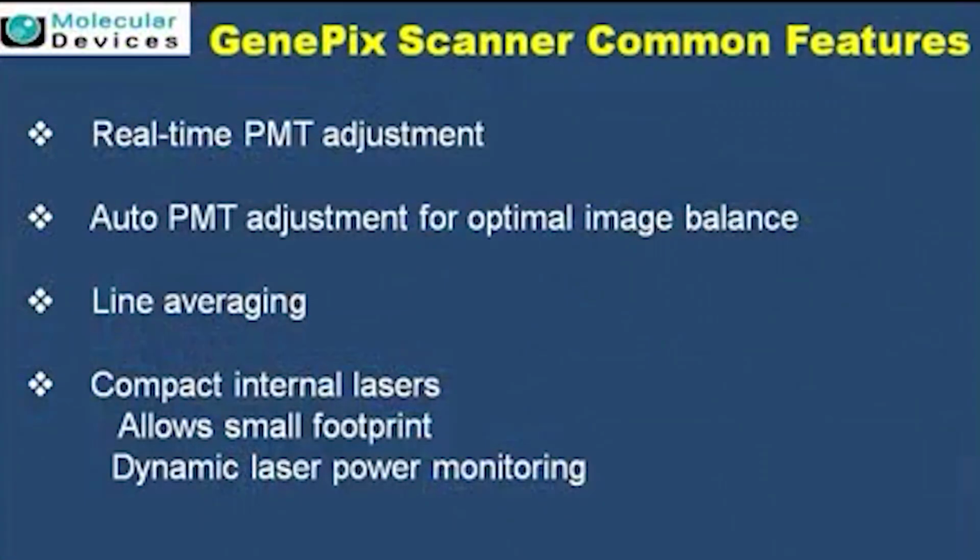Apart from that, upside down, that is inverted chemistry, is what we are going to use in the form of printed sites being scanned directly and controlled for the variability as discussed earlier, and a resolution of 2.5 or 5 microns based on the system which is available can also be used. And real-time PMT adjustment. PMT we have already elaborated, the photomultiplier tube. The real time is at the level of scanning, so we can look at the data when the scanning is live. In this form we can control the PMT live in between the scan.